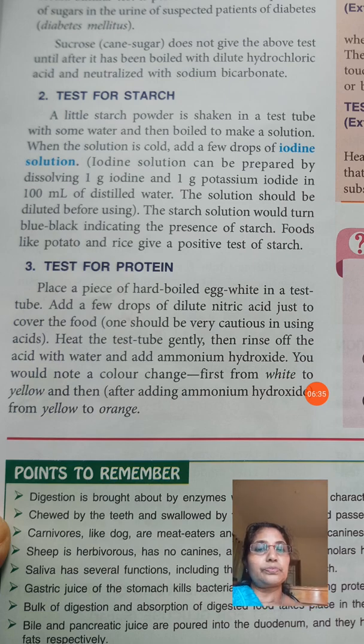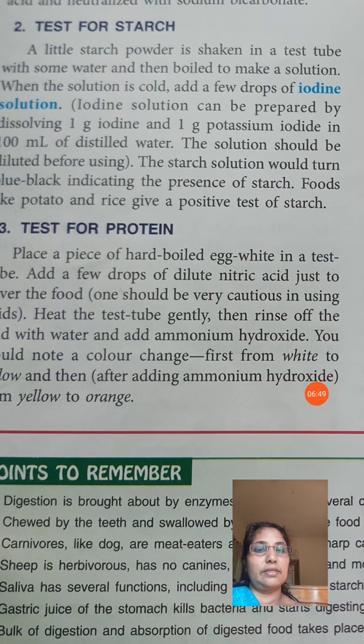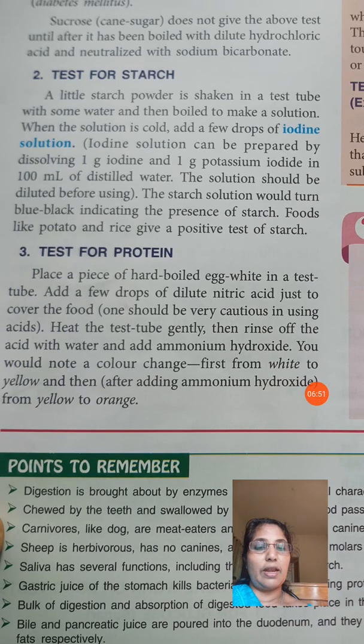Then heat the test tube gently. Then rinse off the acid with water. After heating it some time, wash it well and remove the acid particles. Then add ammonium hydroxide. Those are chemicals that are present in our laboratory. In our school laboratory, ammonium hydroxide, nitric acid, etc. are there. You would note a color change, first from white to yellow.